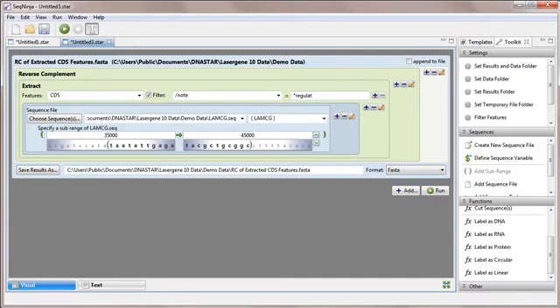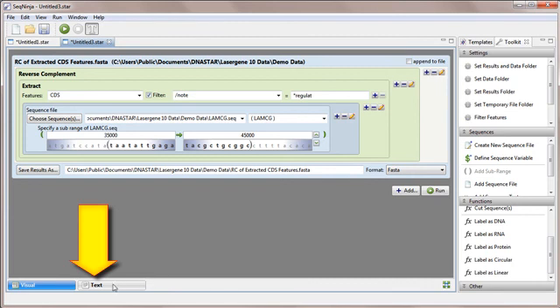So far, we've only looked at SeqNinja's visual view. To open the text view, click on the Text tab at the bottom of the window.